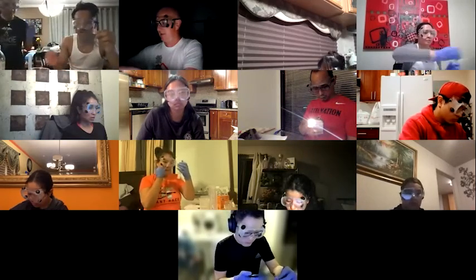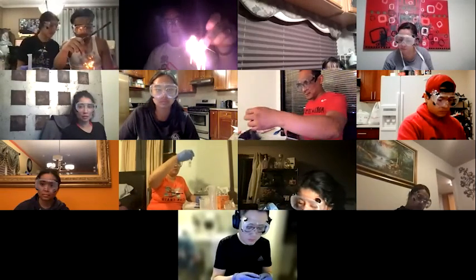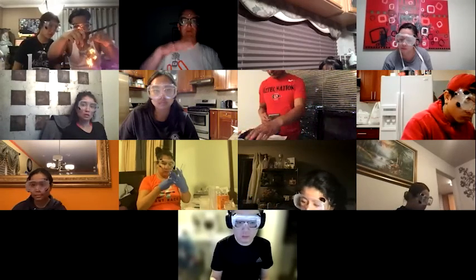And then you get that same color change. You're left with this gray color. Yeah, I'm gonna do that one again. Yeah, this one freaked out my high school students when I was volunteering in San Francisco. It's really cool, right? I bet them that the steel wool would burn, and they said, oh, you're crazy. And then I took their money too. Yeah, and then you get these tiny little wisps and then gone. Make sure you don't do that over something flammable.